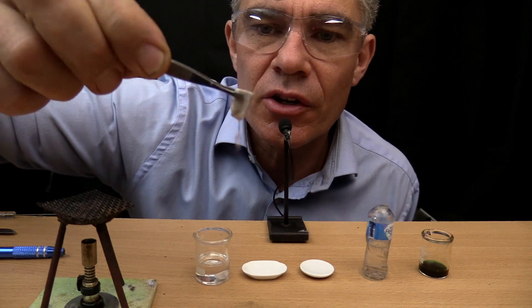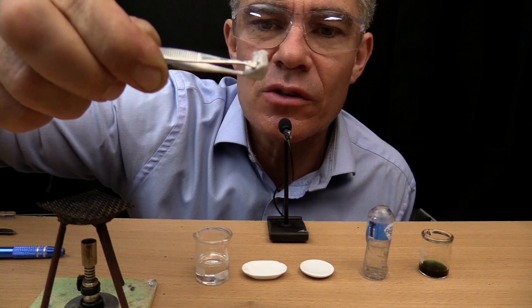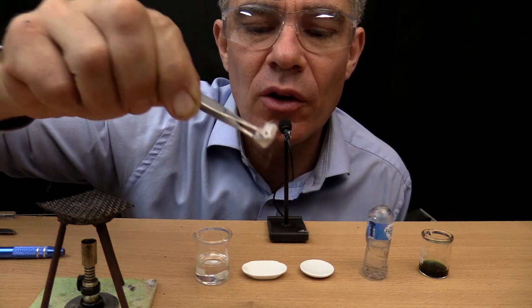That's the chunk of sodium. It looks a bit white. That's because it's got a sodium oxide — an oxide coating over it. Which is the white look.